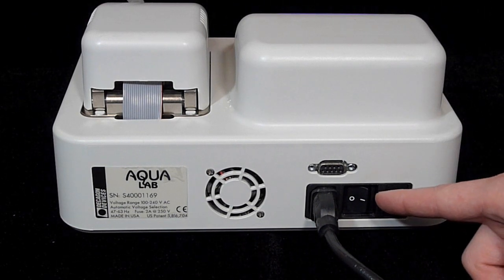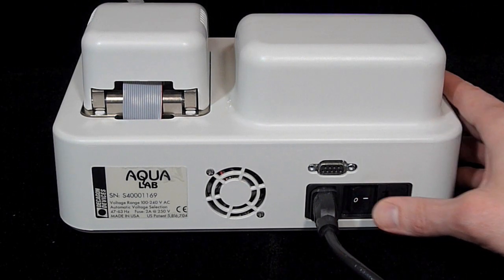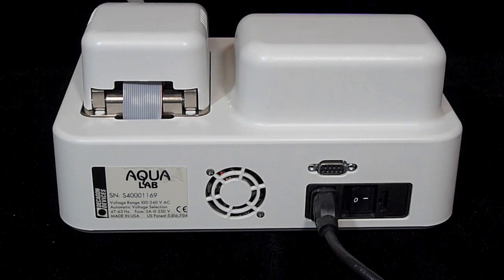Step 1: turn the instrument on. The power switch is on the back of the instrument, down low around the back left corner. It's a small rocker switch. Push the switch on and let the Series 4 start warming up.